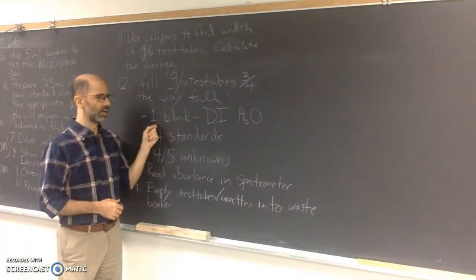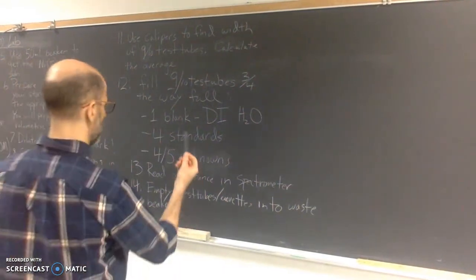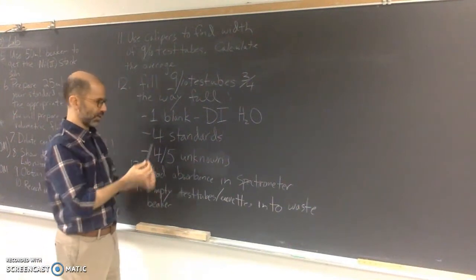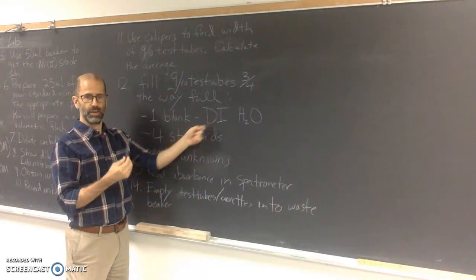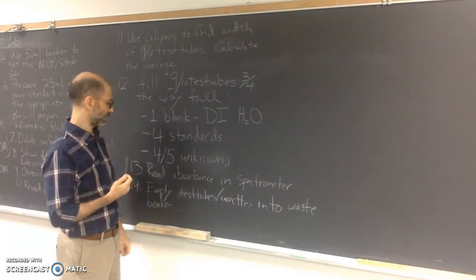One of the substances is your blank. So you're going to have one of these cuvettes or test tubes, and you're going to fill it 3/4 of the way with DI water. That's going to be your blank, and I'll talk about how you're going to use that blank.